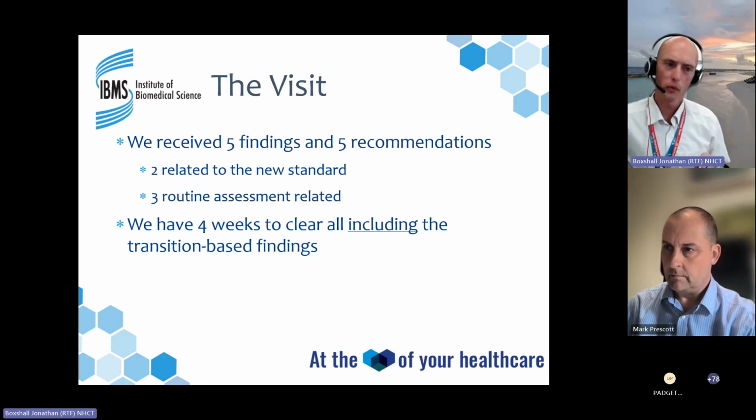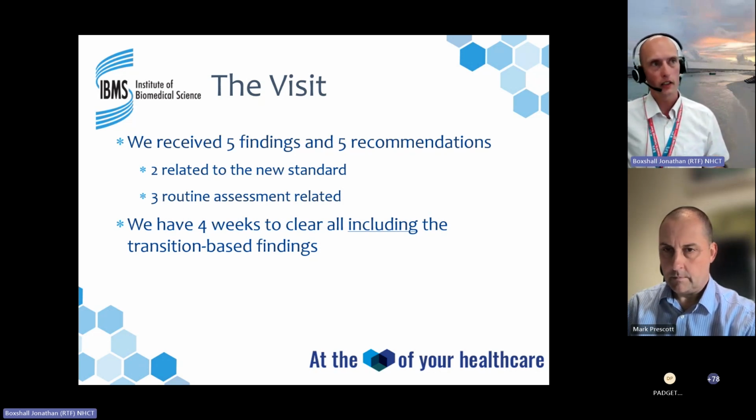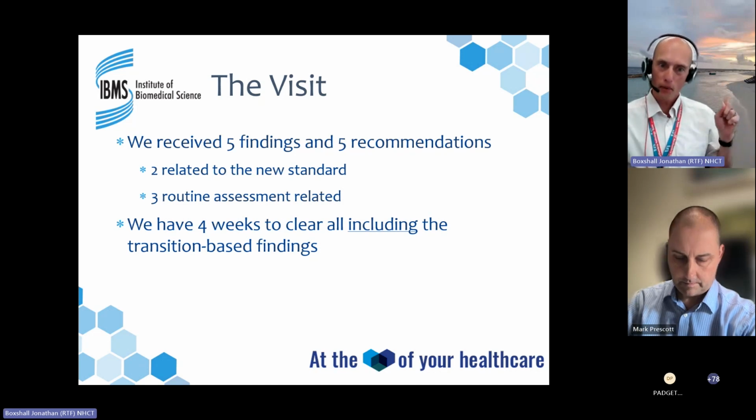And just another thing that Mark was saying about where we are still finding things which are more surprising, going out technical assessing. I've been to a lab recently where they haven't got a measurement uncertainty for what they should have done, and it is probably falling under the sampling exercise.